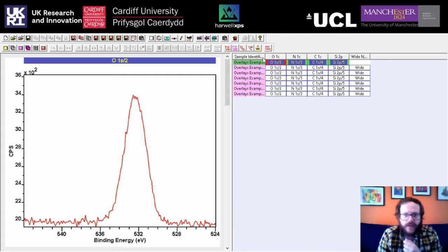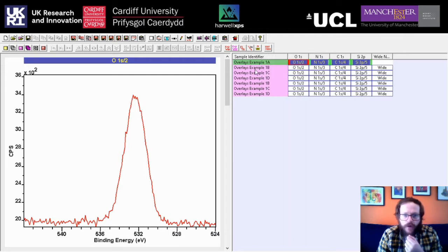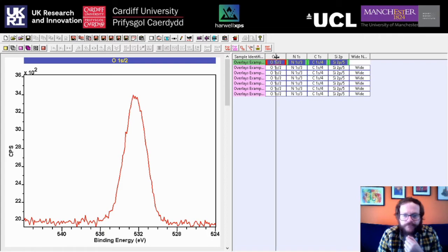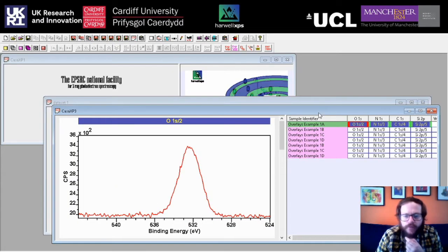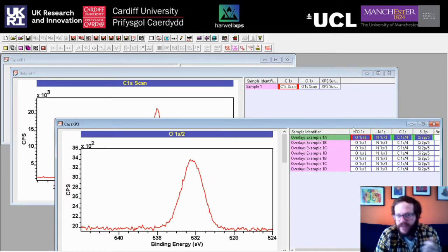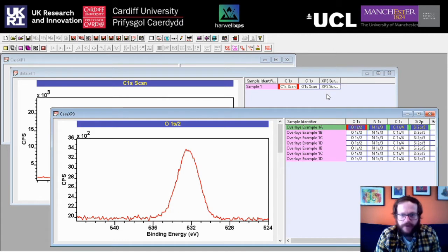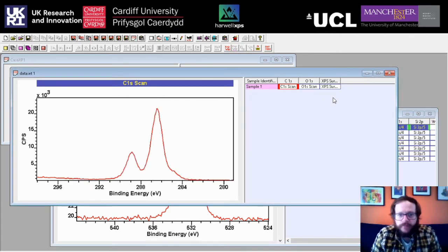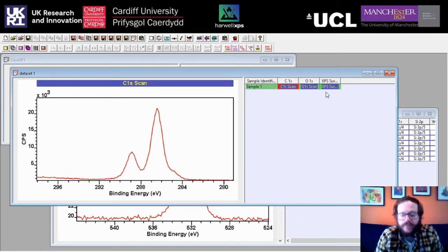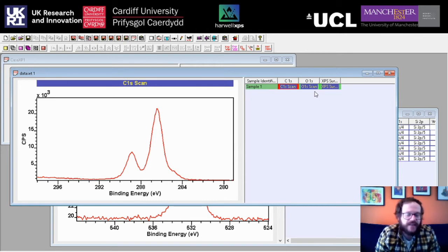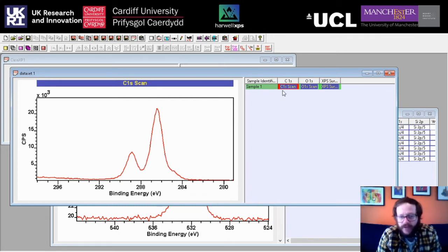Transfer the existing row labels, because that's going to dictate what appears as the sample name, and we're going to want those to say what sample they are. Now for the final bit of file management: if you click on the row name it will select all of the VAMAS blocks associated with that sample, and we're going to use CASA's copy-paste function. This doesn't work brilliantly so I don't recommend it for everything, but it can be quite useful for moving a single dataset across from one sheet to another.